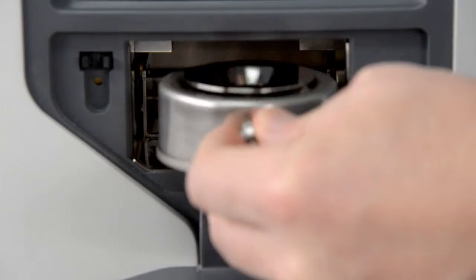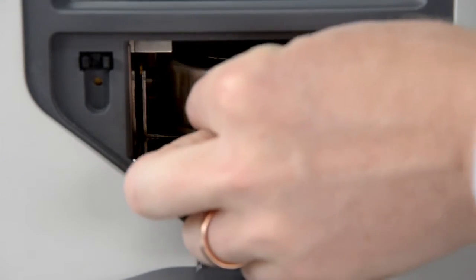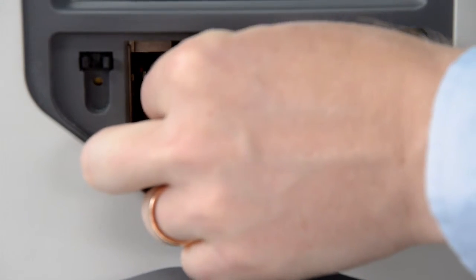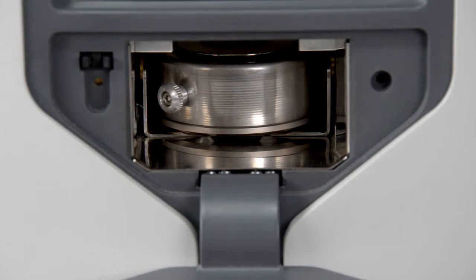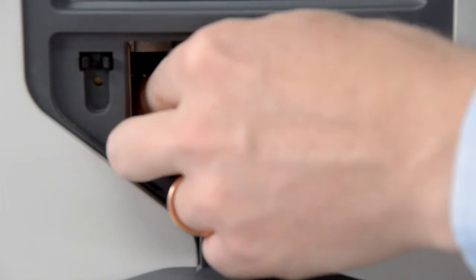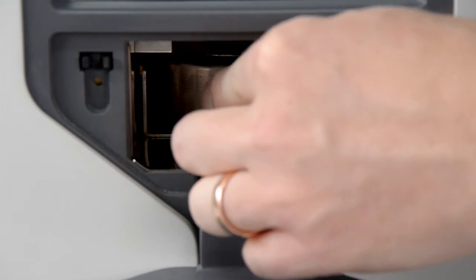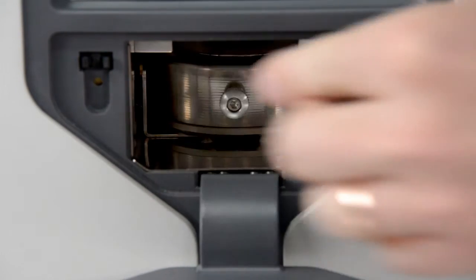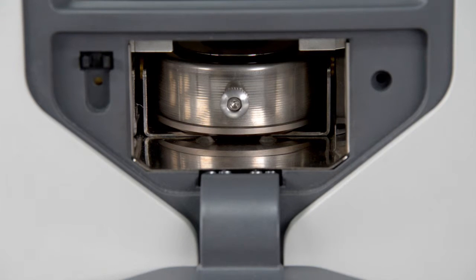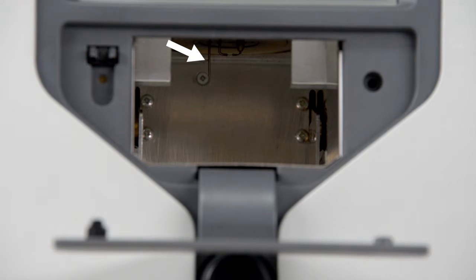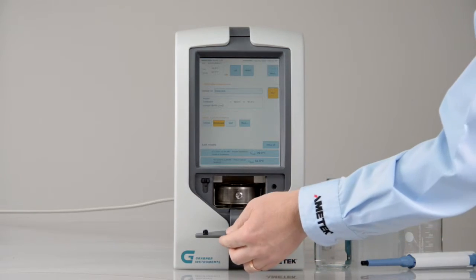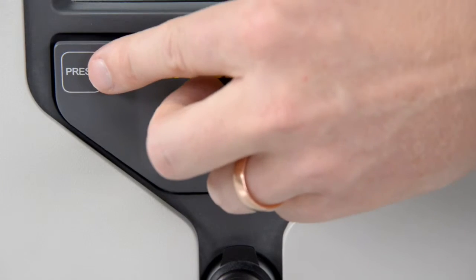Open the flap and insert the cup holder. The notch at the bottom of the cup holder has to sit correctly on the lift plate. Please pay attention that the handle points outwards. Make sure not to bend the temperature probe in the measuring chamber. Close the lid again.